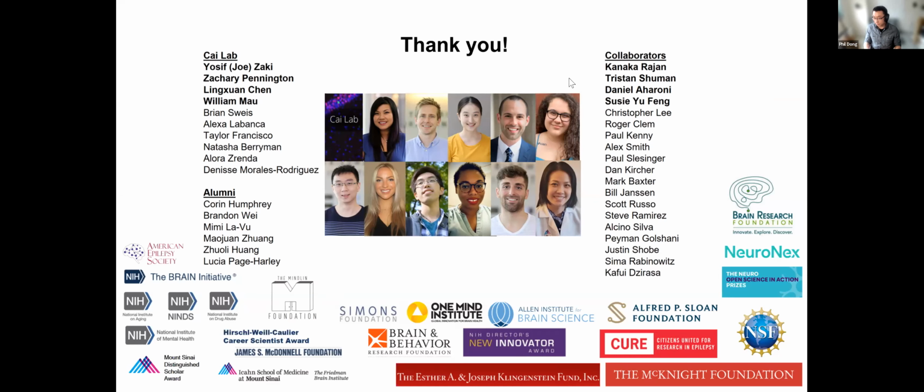If they don't, I'll go ahead and change them based on the animal. One thing that could potentially be really different is the density of cells, which for sure will affect a few parameters in the pipeline. But usually the differences in parameters are quite minimal within an experiment. So the approach we take is usually to make sure the same animal uses the same parameters and try to keep it consistent as much as possible.